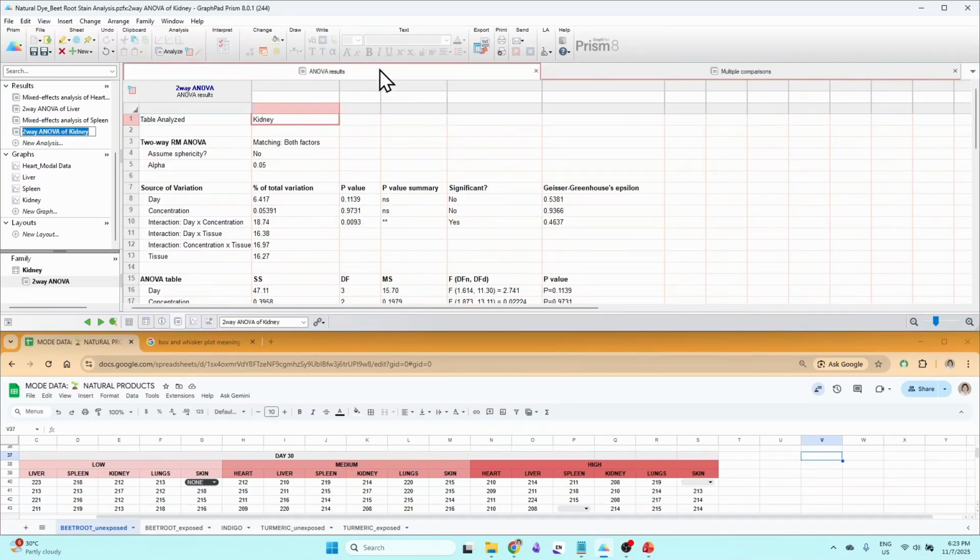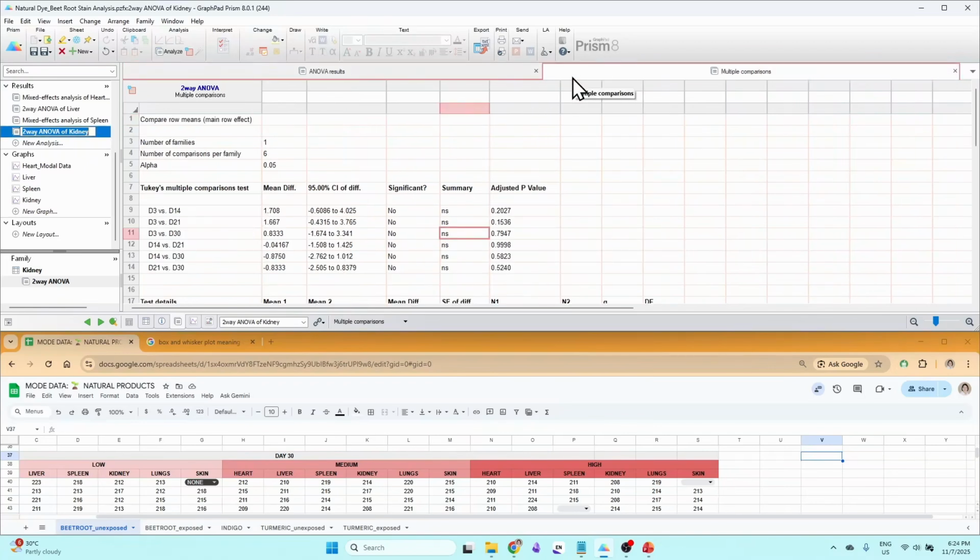First, it says here in the first tab of your statistical analysis that the interaction between day and concentration is statistically significantly affecting the differences in the means between the different concentration groups. Okay, but these two asterisks, we will not put in the graph itself. You would have to put this in the table of your results, and please refer to the old thesis files that I will send you for the layout and format, okay?